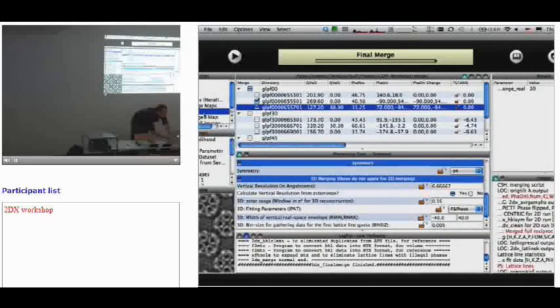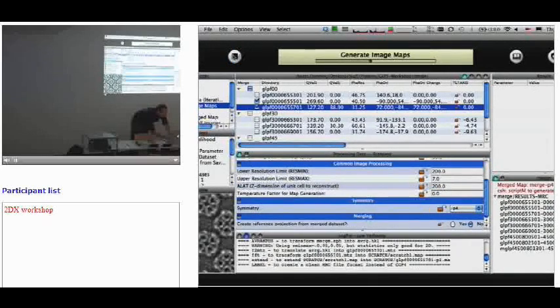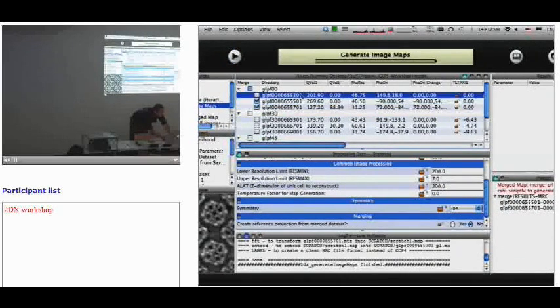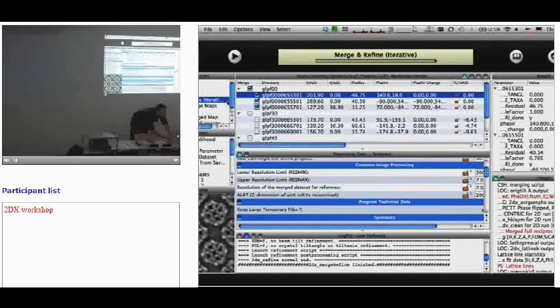So I can regenerate these projection maps to check what we have. So this was correct in the beginning, and now these other 2 are also roughly correct. Not very precise, but okay. And now we can do this a few more times. This is the number 2 here. The screen is not large enough.